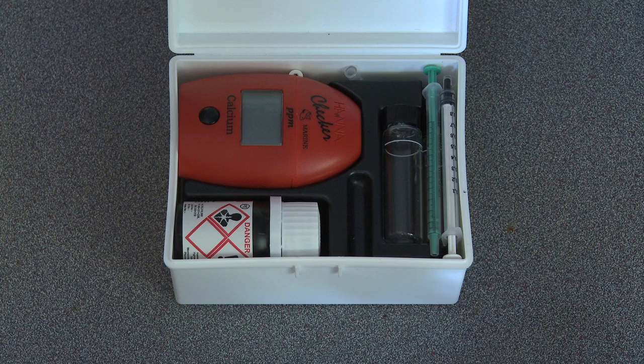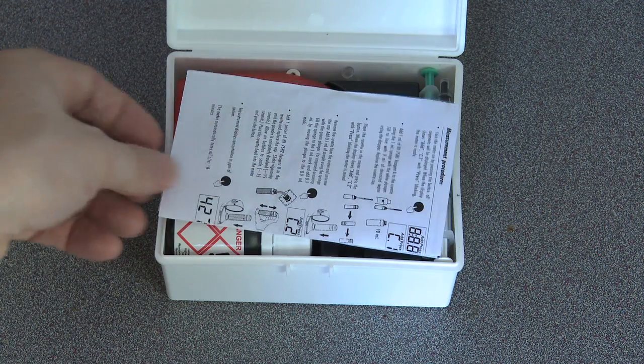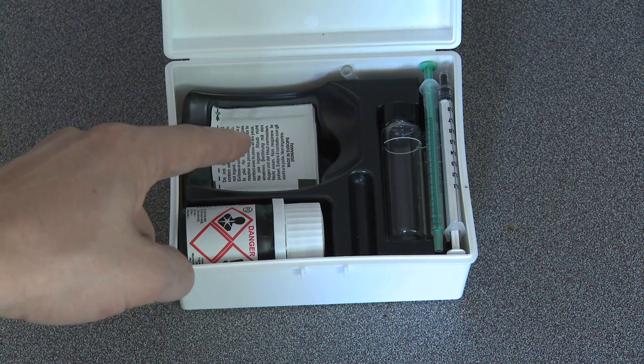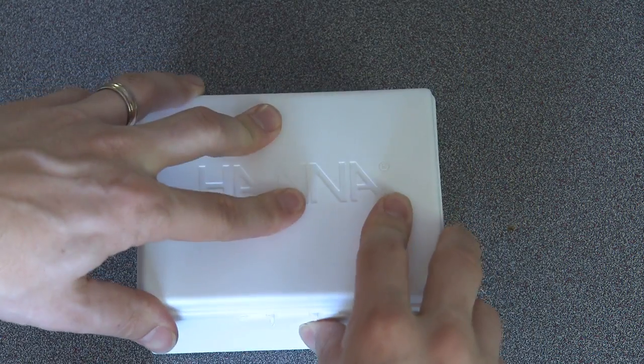Here's another thing I like about the calcium checker. Hanna did a nice job designing the packaging so that everything fits inside nice and neat. The powder reagent fits right under the calcium checker itself in its own neat compartment. Awesome — that means the lid actually closes!